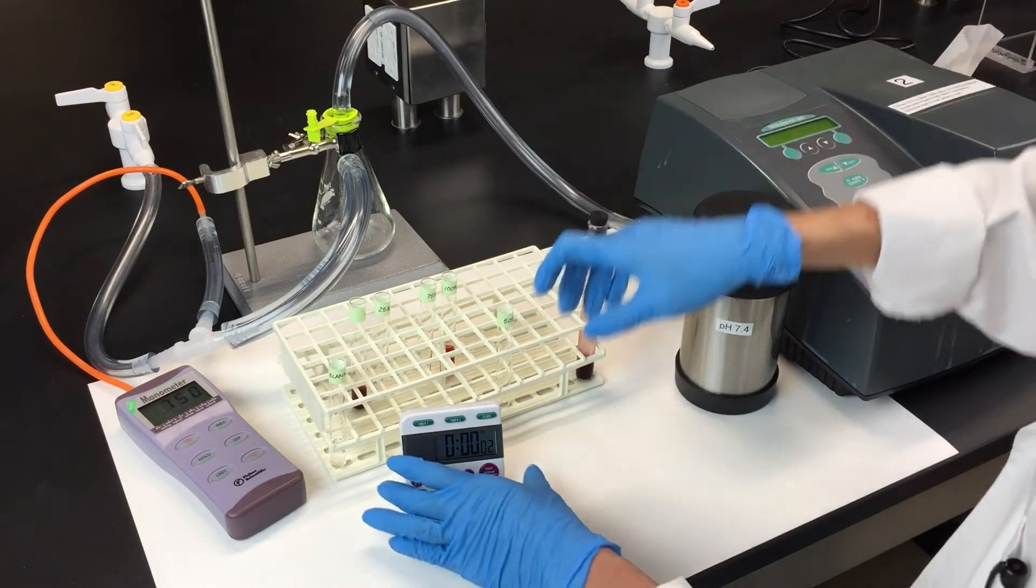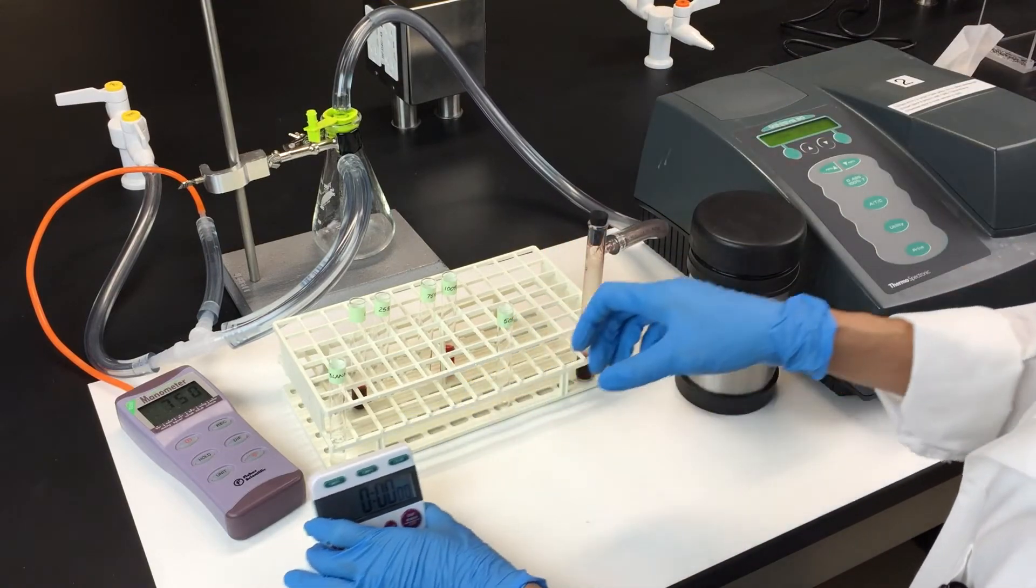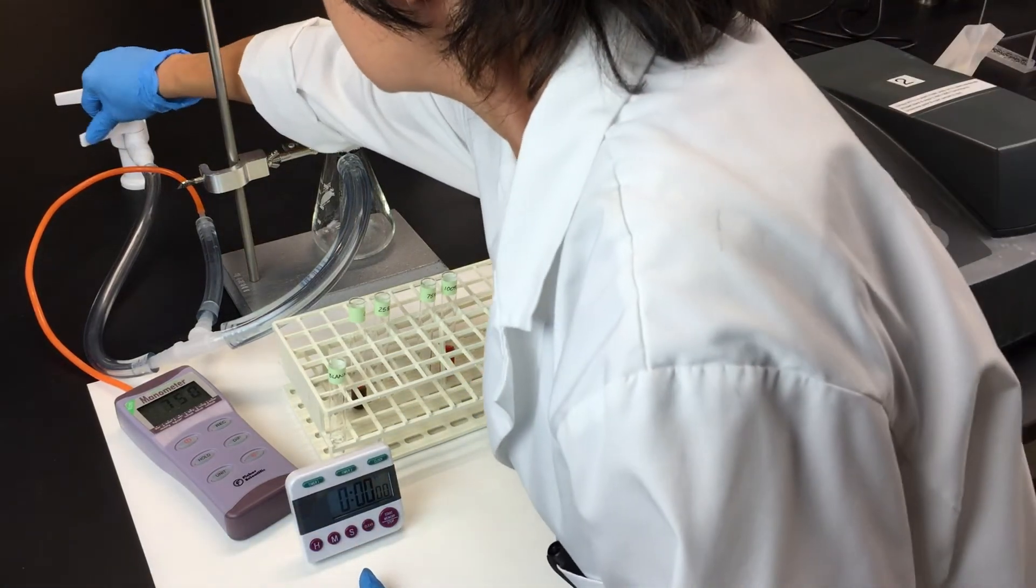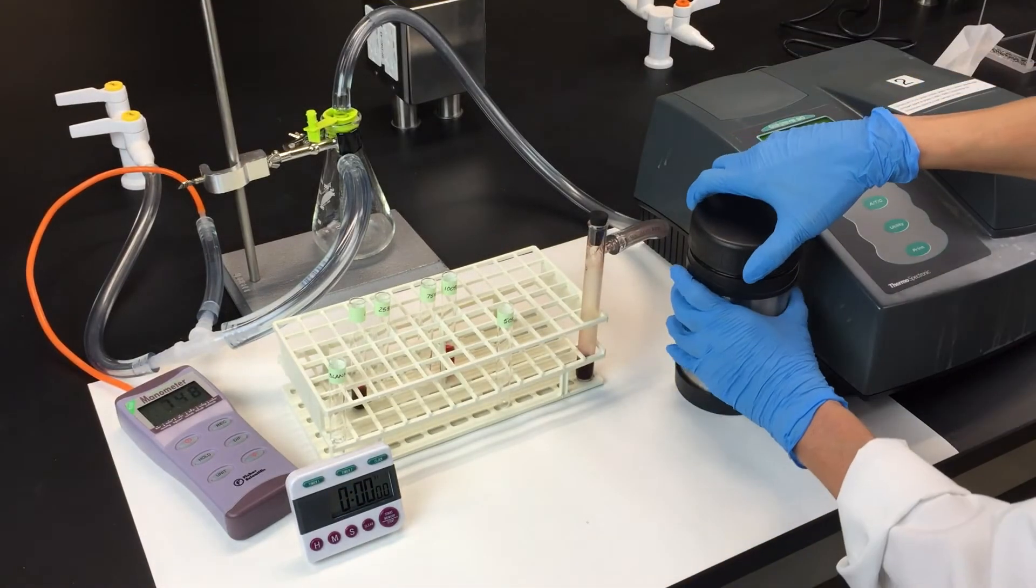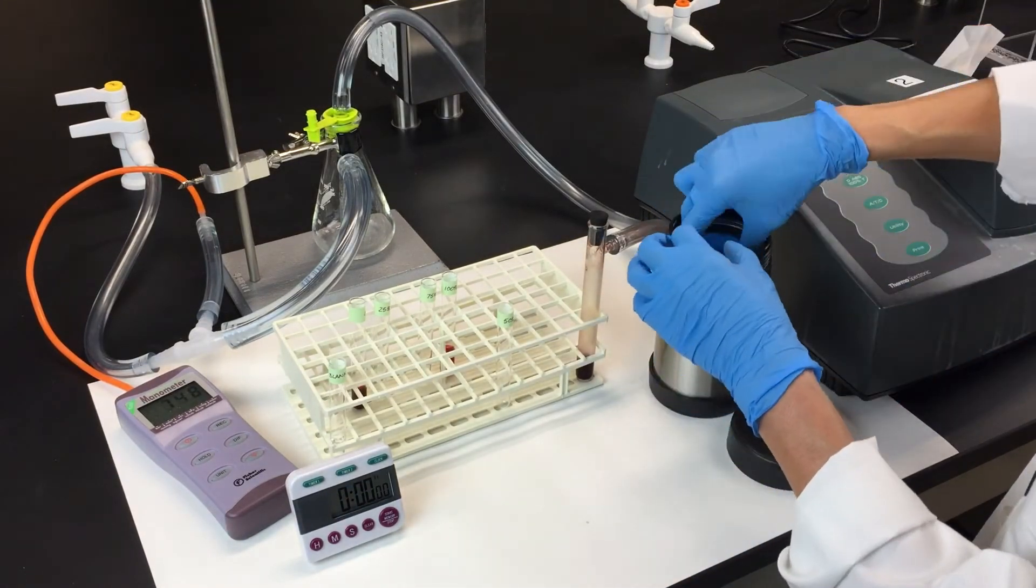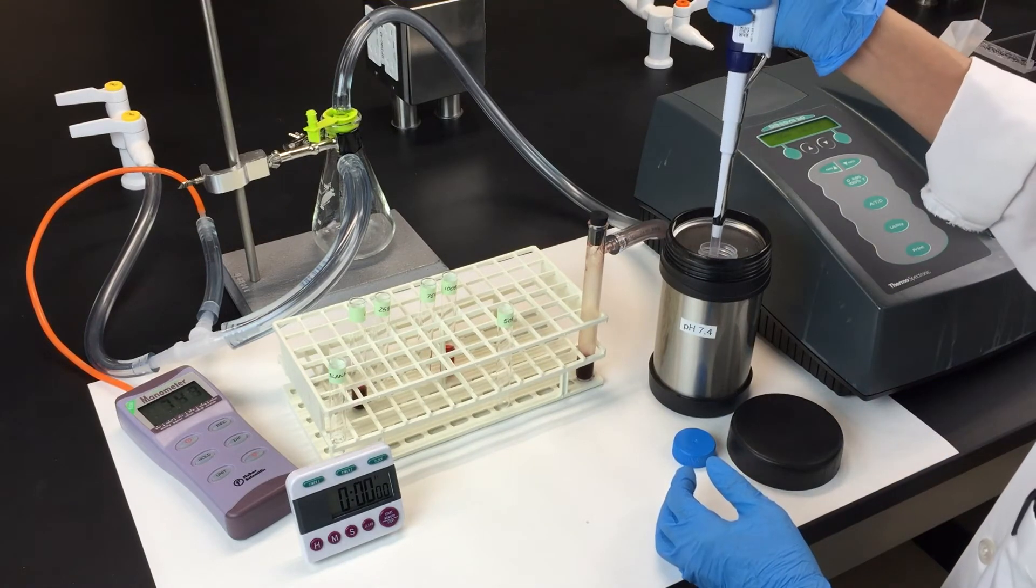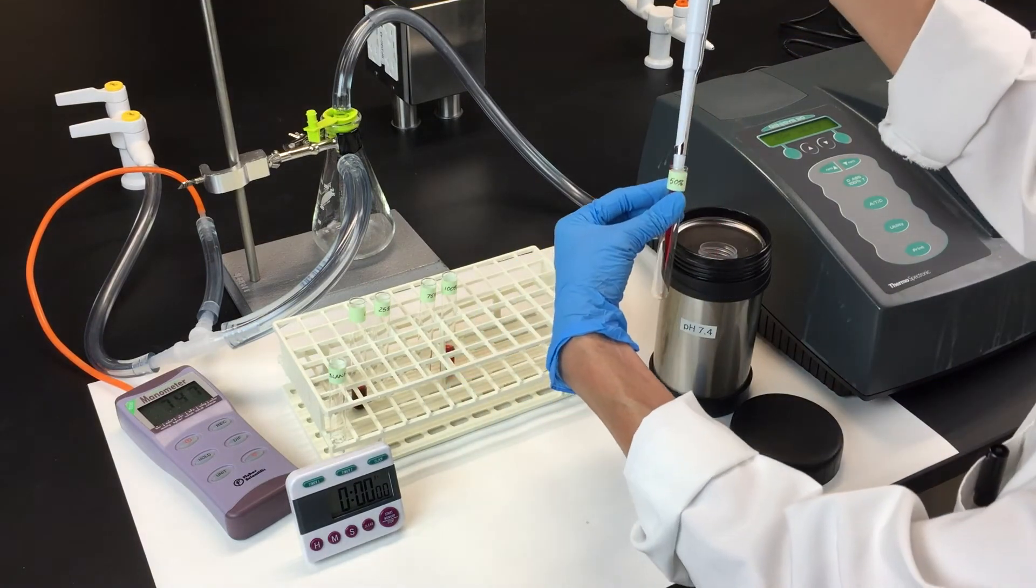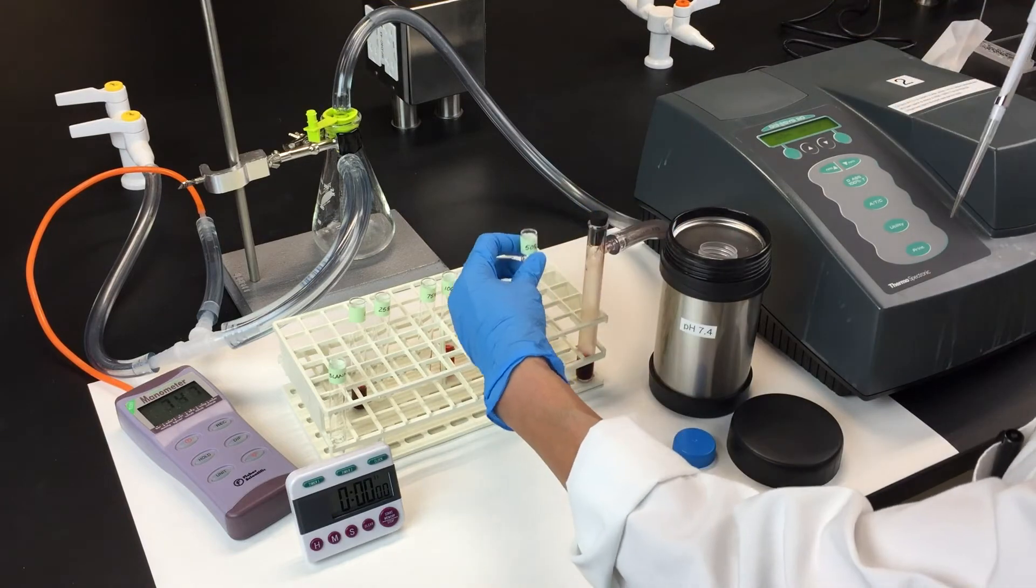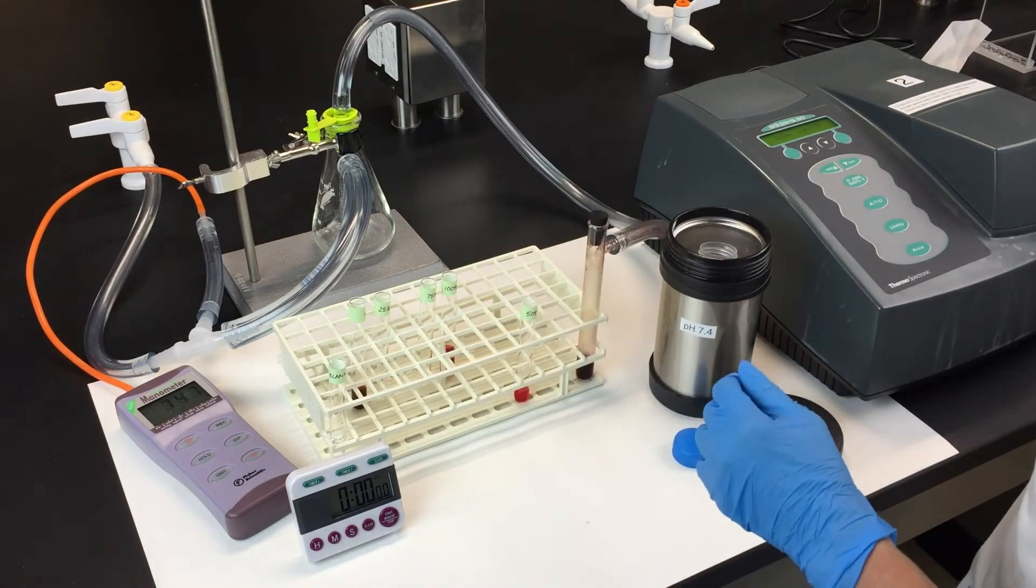When the hemolysate sample is fully deoxygenated, get ready to set up the 50% oxygenation tube. Transfer one milliliter of the fresh hemolysate to the 50% oxygenation tube. This part has to be done very accurately, so we'll use our micropipetters for this.